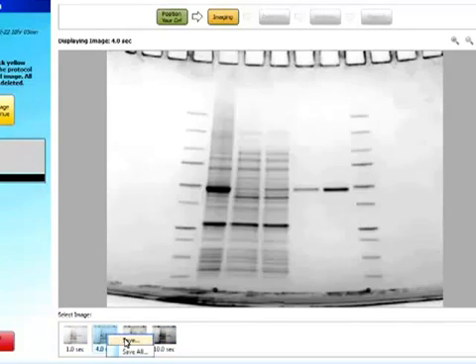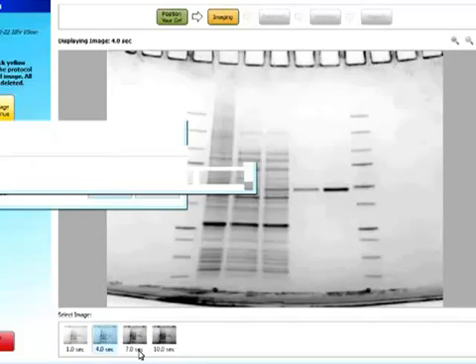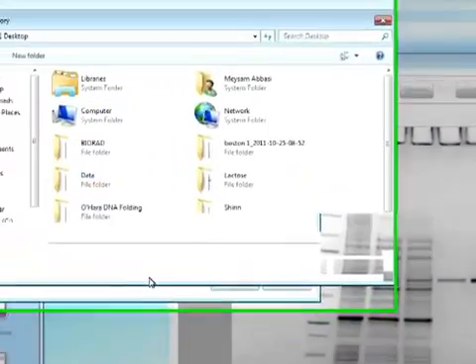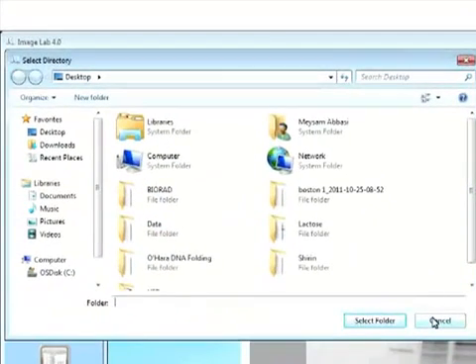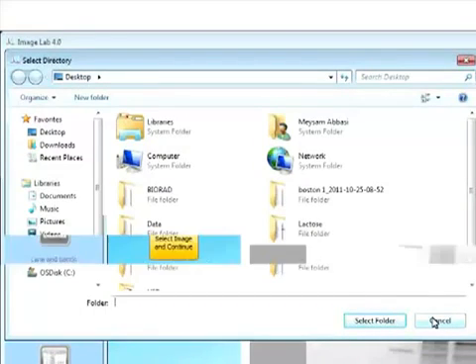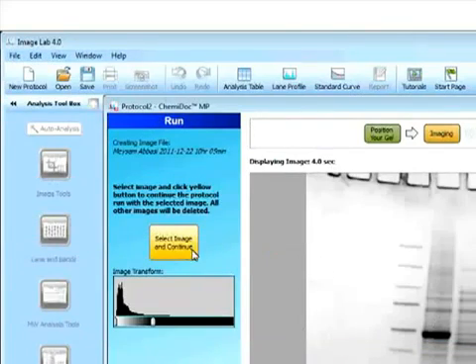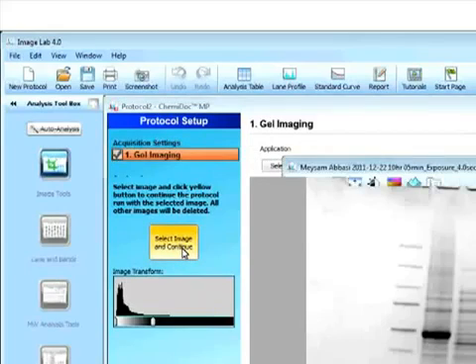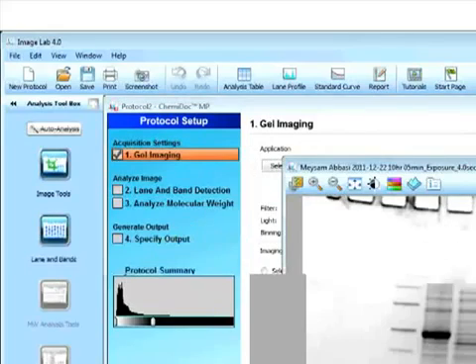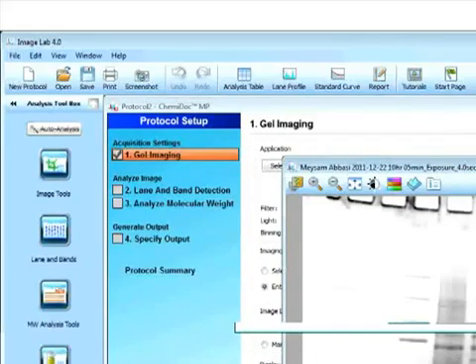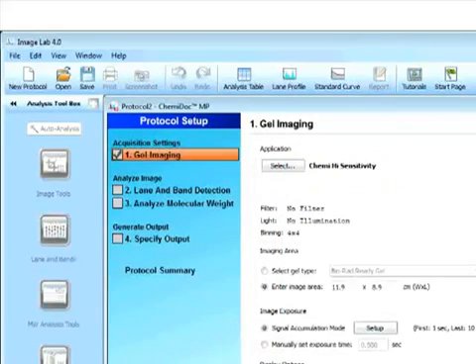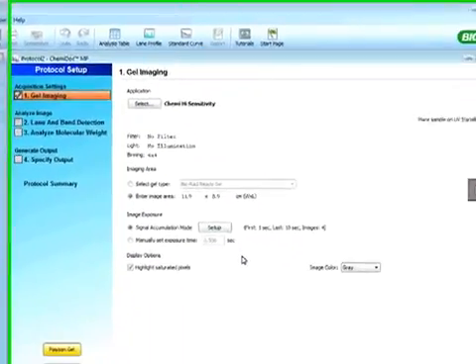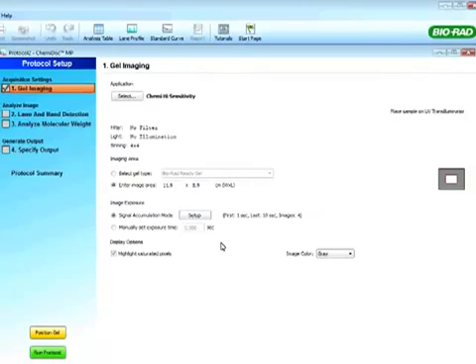And I can right click to save one or save all of my images. So if I save all, it will be saved as a nice folder with all the image files. And then I can select an image to continue as well. So this is how easy it is to look at our chemiluminescent blots.